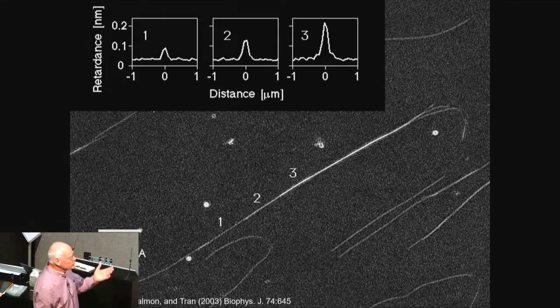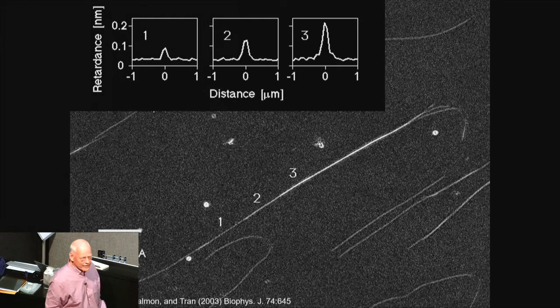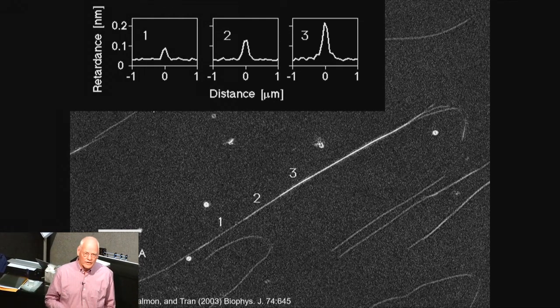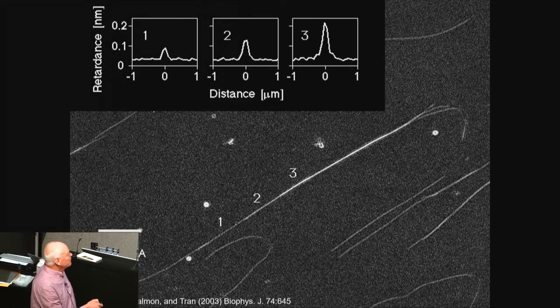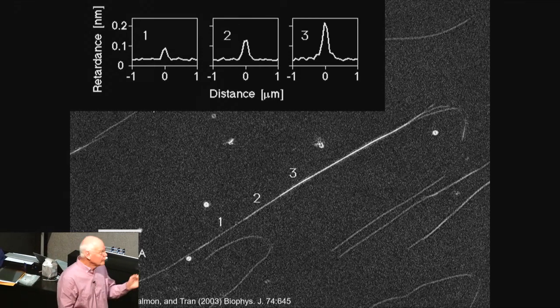So it's really a scattering problem that you have to think of, where one polarization is scattered a little more, with a little more phase shift, than the other polarization. But it's a very quantitative way of assessing.